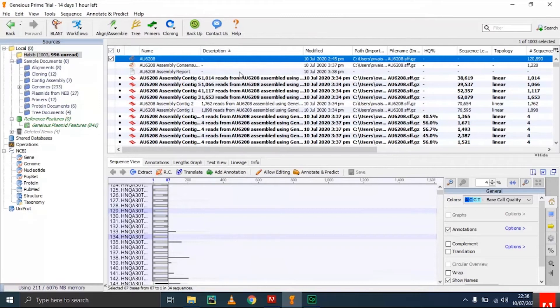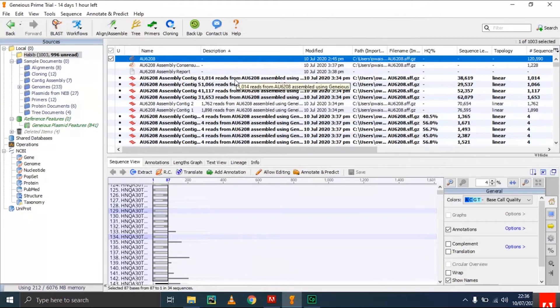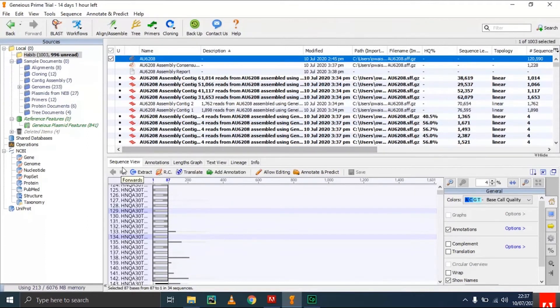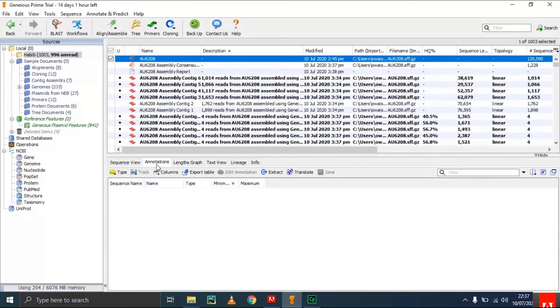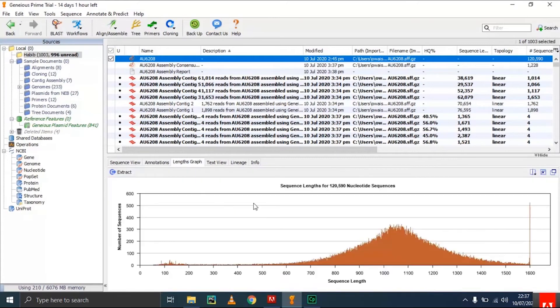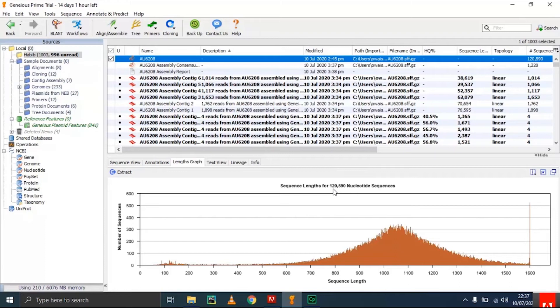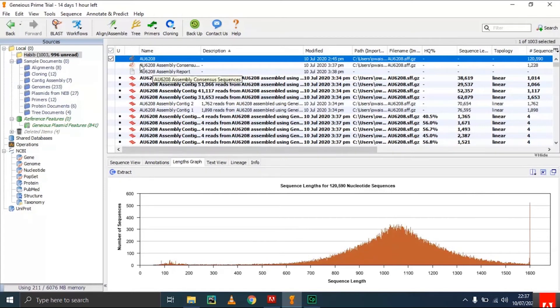It will depend upon your file and your data. This is what I got from my file containing different reads. There are different features we can perform here. This is the sequence view—you can see annotation, length of the graph. This graph shows the number of sequences and sequence length distribution. For my data, the sequence length was about 120,590 sequences. This is a large dataset.